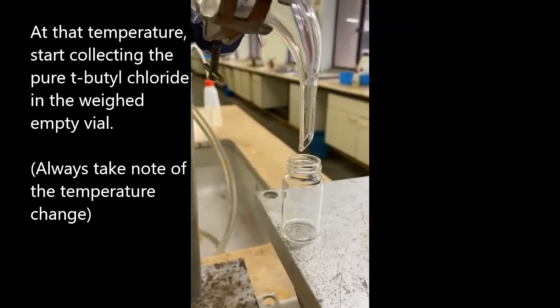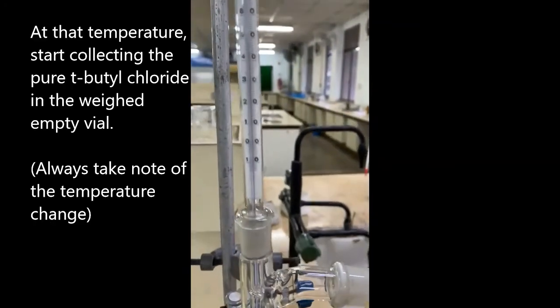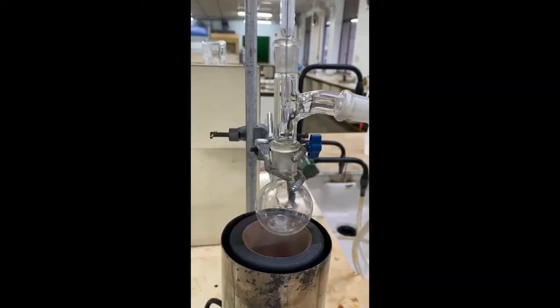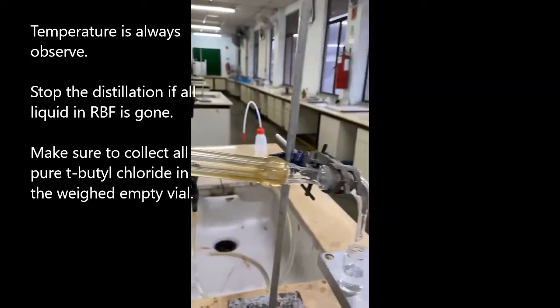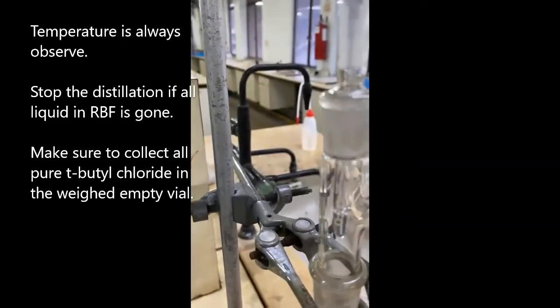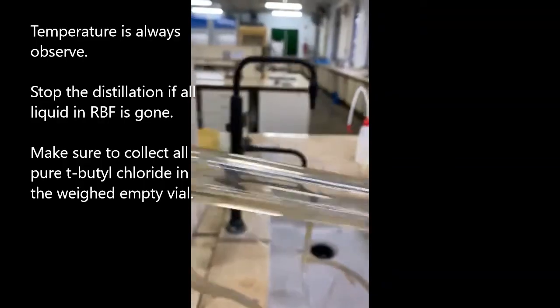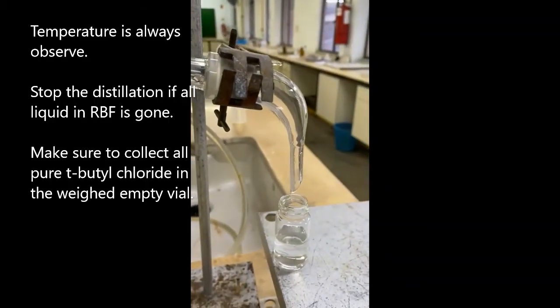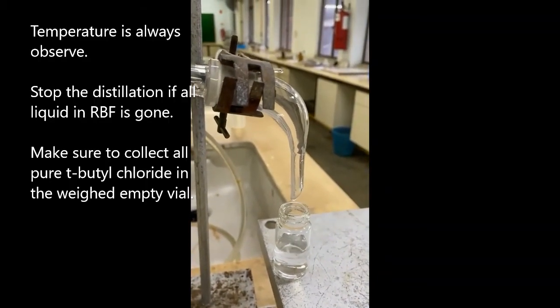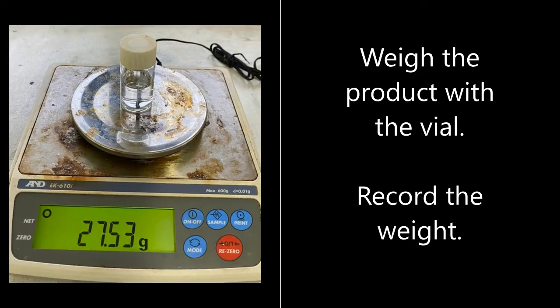Always take note of the temperature changes. When the liquid in the round bottom flask has dried up, stop the distillation process. Ensure that all purified tert-butyl chloride is collected into the vial. Weigh the pure product with the vial and record the weight.